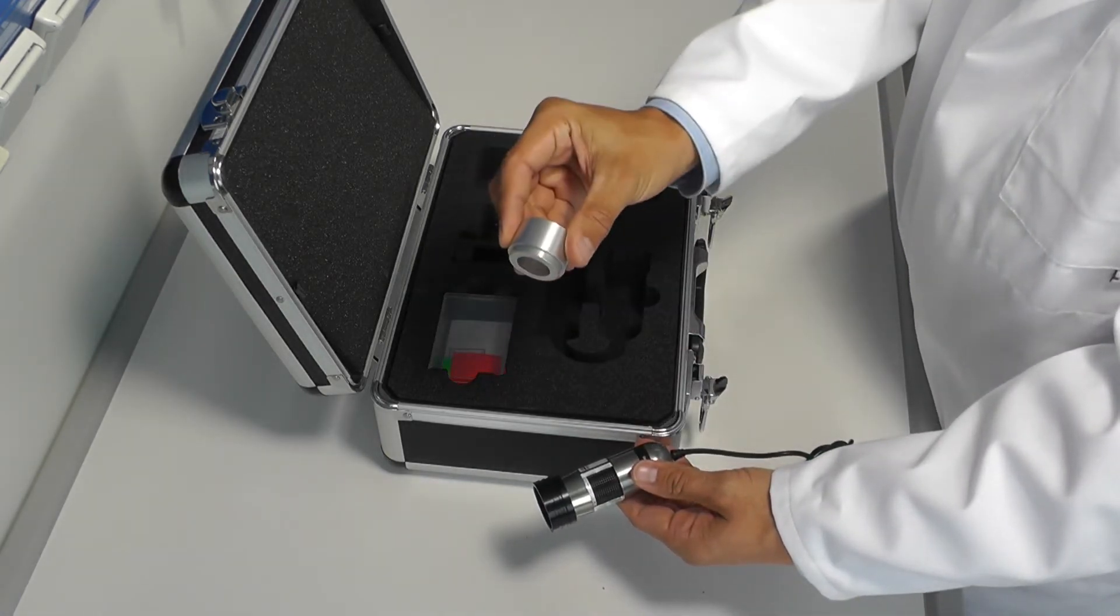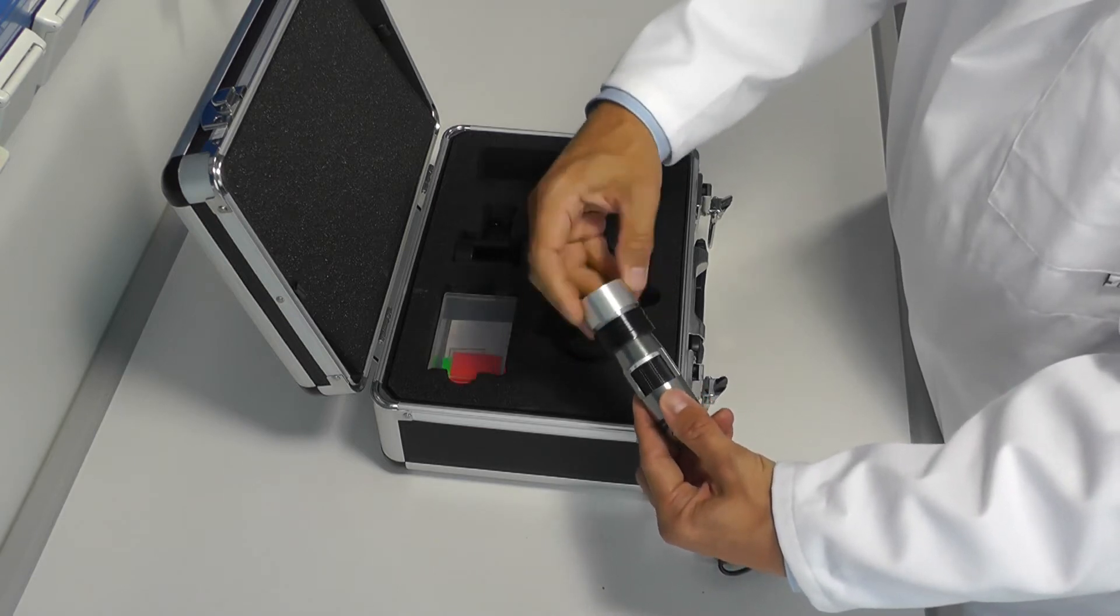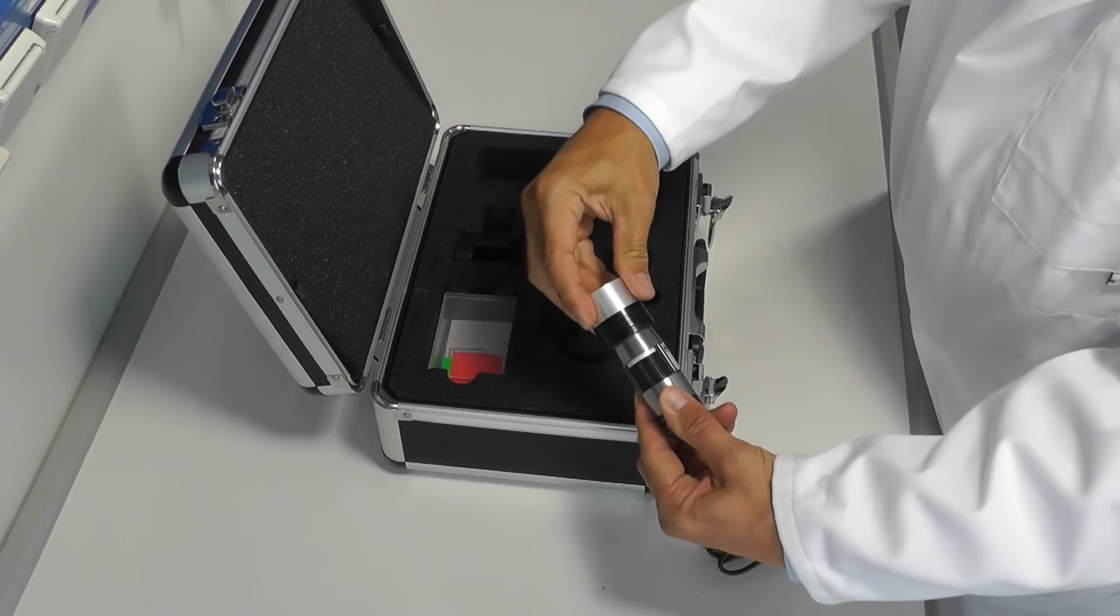Then there is an adapter tubus that is meant to define working distance to the sample and field of view. Simply screw it to the thread of the detector unit.